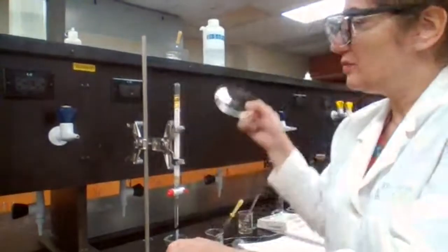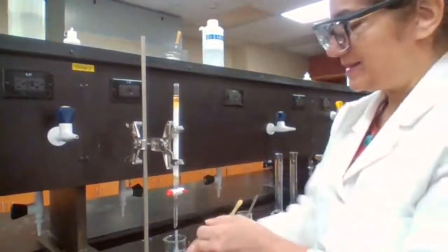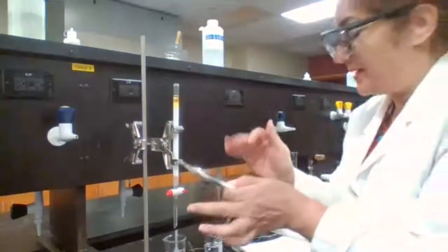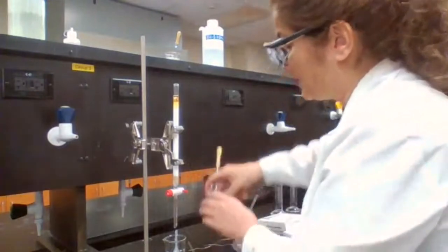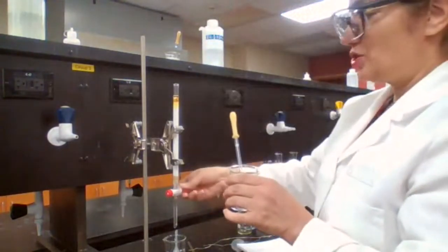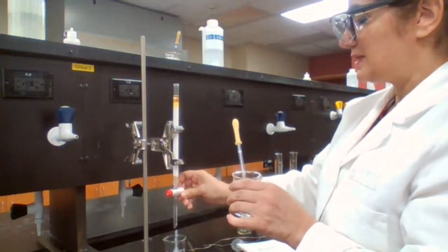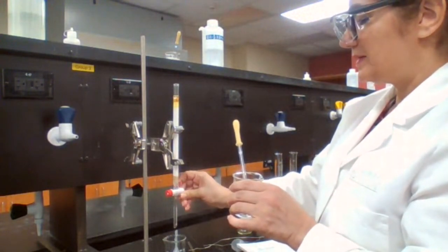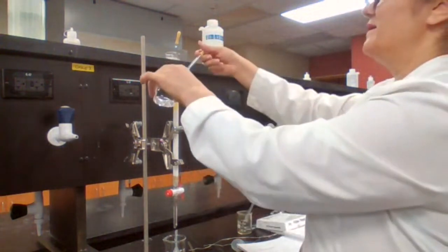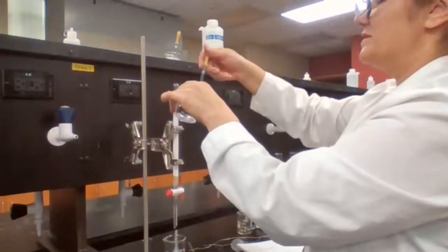So I'm going to have to add solvent, drain, and test this. That's why I said this is like a 2% job. I'm going to try my best to do this without letting the top of the sand get dry. At any time, it should not be dry. So I'm going to have to do this very slowly. Open it to elute slowly, and I keep adding the solvent.